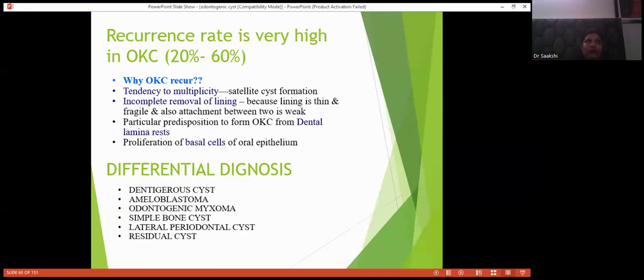Even for the third year students, in viva we most commonly ask, okay, differential diagnosis of this. For the spotting also, we have given you the diagram. Next question we usually give is a differential diagnosis. आप उसको, क्योंकि sometimes it is very confusing to identify the slides. Sometimes they all look similar. For the students, they usually look like pink and blue only, or pink or purple only. So differential is very, very important.